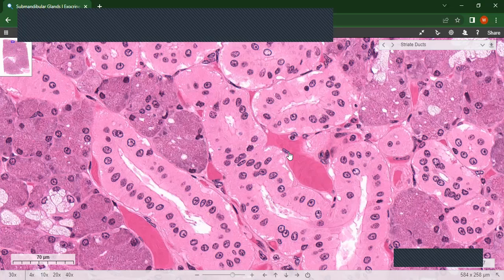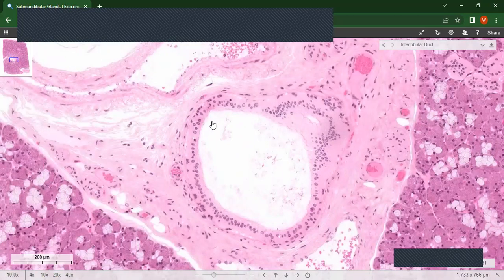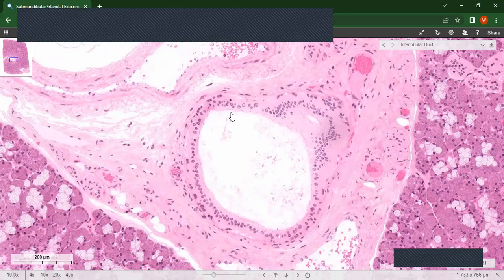In the ducts, we have intralobular ducts and interlobular or extralobular ducts. The extralobular ducts are where the striated ducts drain into, and they are larger. You can see the lining epithelium here is stratified — stratified cuboidal or stratified columnar — because the nuclei appear in two layers, meaning two cell layers. This is the interlobular or extralobular duct.